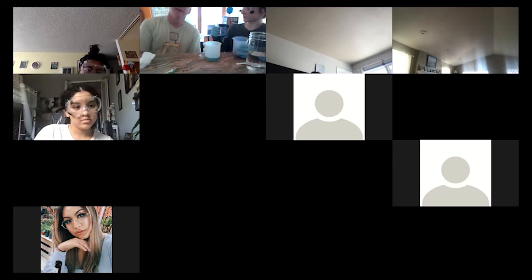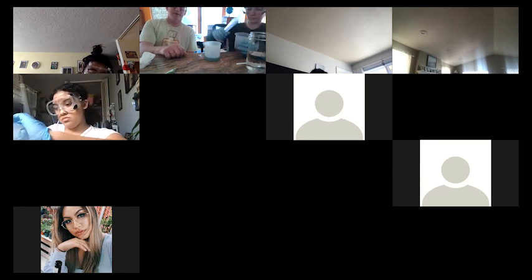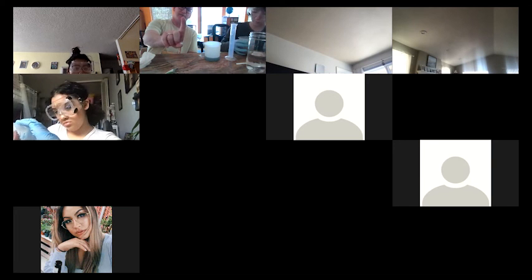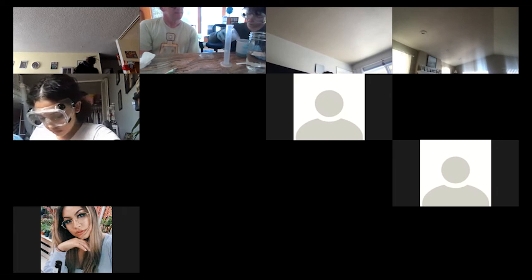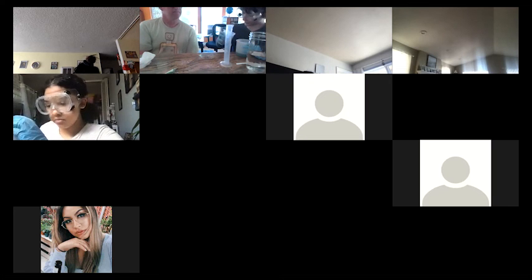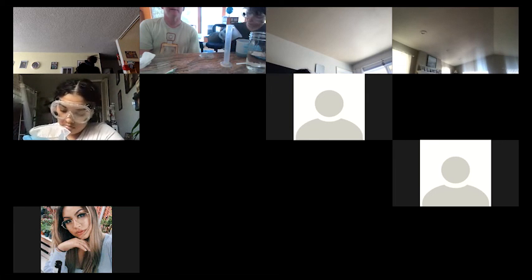Yeah, so there's a couple of things that could have happened. One, you didn't let it dry out enough, and so the additional mass is from water. What's the other thing that could have happened? Did you swirl it around? Okay. How many times do we rinse it without the filter? I don't know, it's in the procedure.